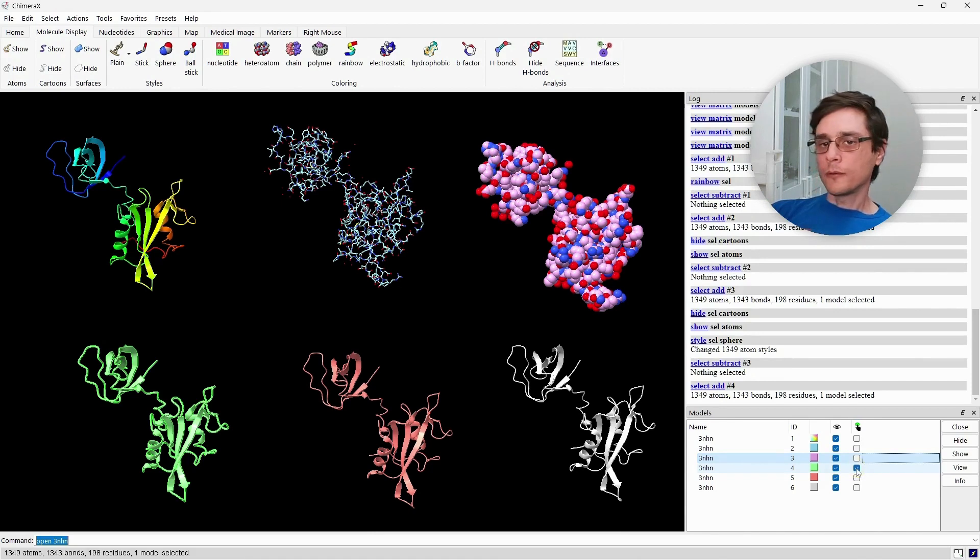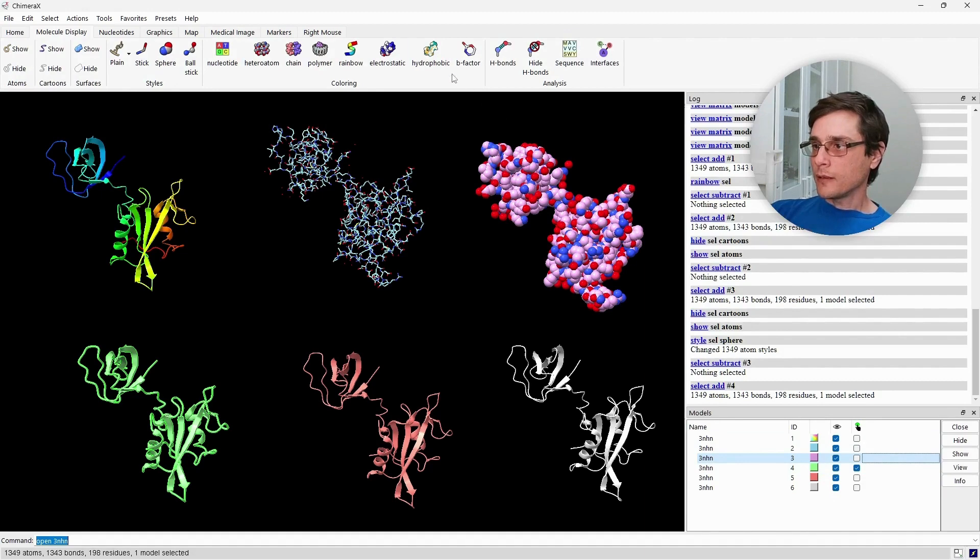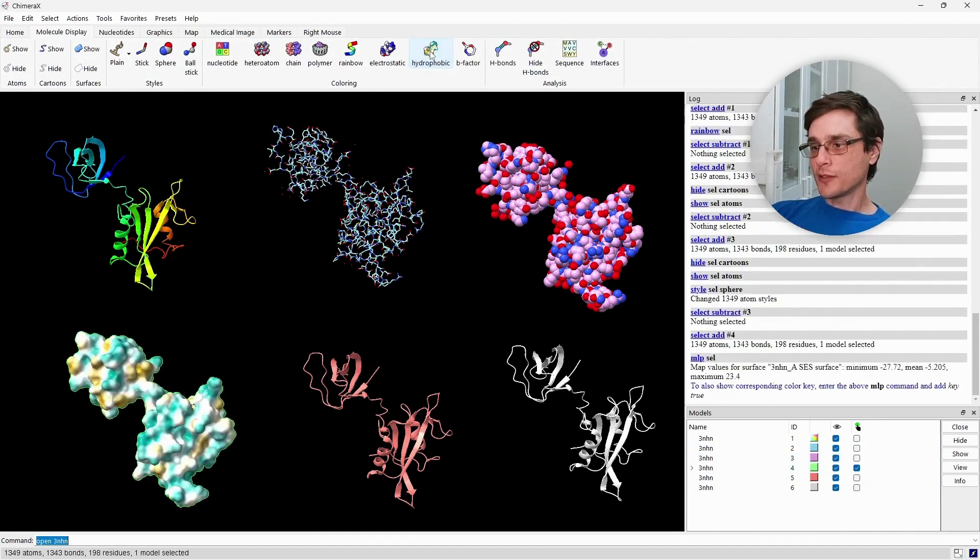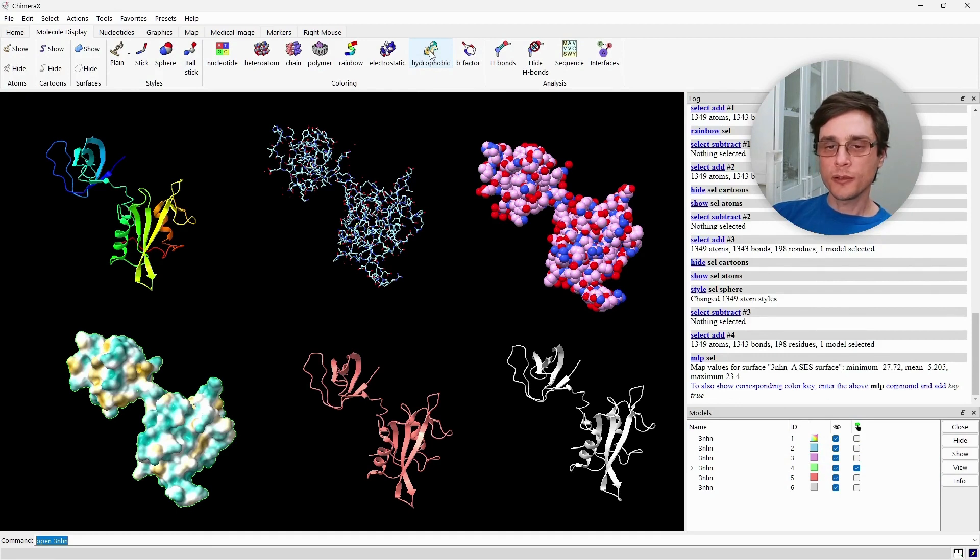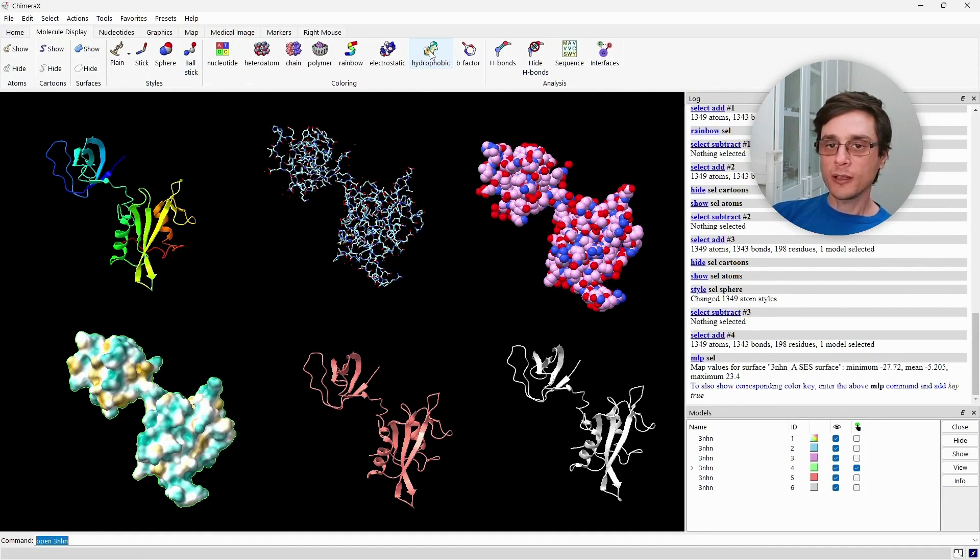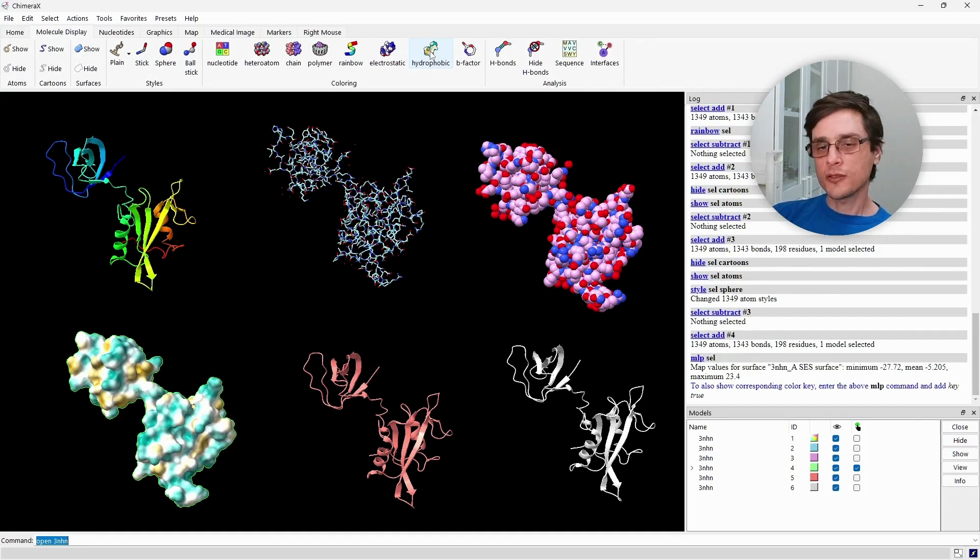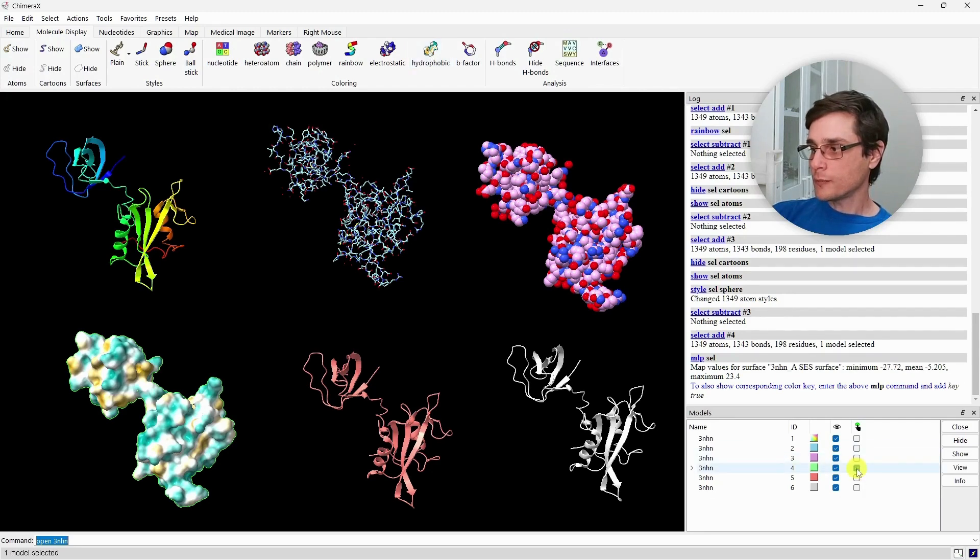For the next examples, ChimeraX provides very easy shortcuts. Let's style this model as hydrophobic surface. This type of representation is suitable, for example, for transmembrane proteins. It would show us that the hydrophobic parts come in contact with the membrane, and the hydrophilic parts come in contact with the cytosolic or extracellular parts.